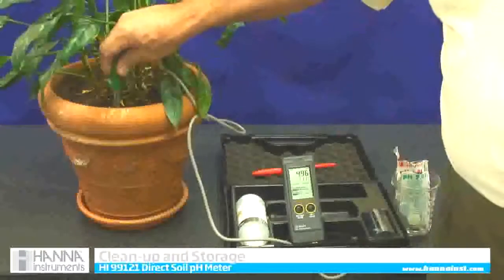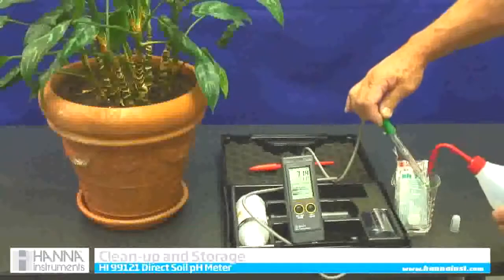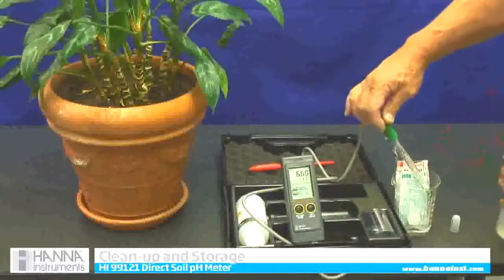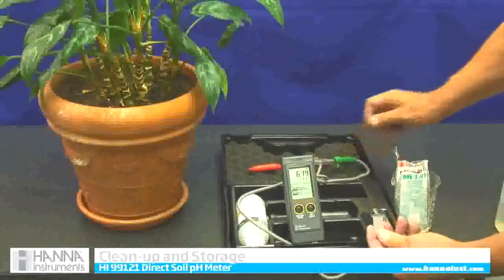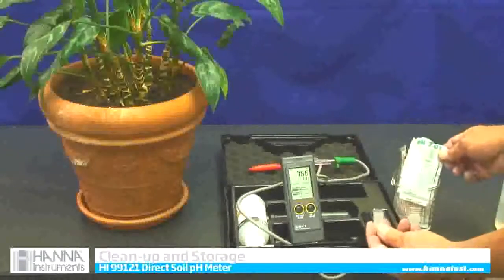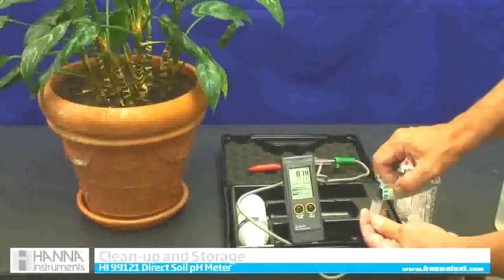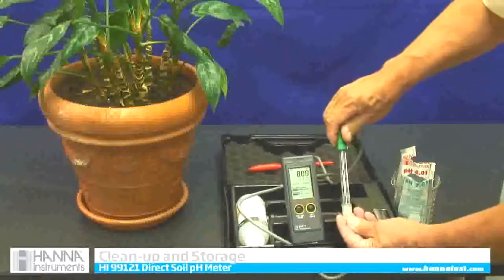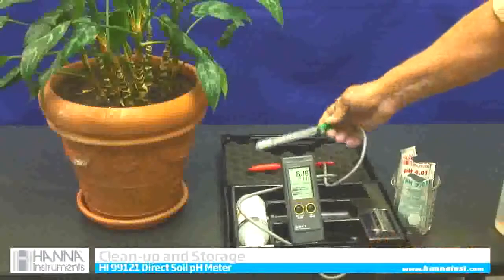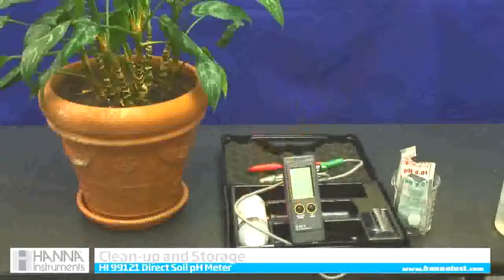Now to store the probe, I am going to take it out of the soil and rinse it off. What comes in the kit is a cap — a nice little cap. I am going to take one of my buffer solutions, doesn't matter if it is the 7 or the 4, and put a couple drops in — don't need much — then store the cap. Now I am good for quite a while. I can turn it off. It also has an automatic 5-minute turn off. And I am done.